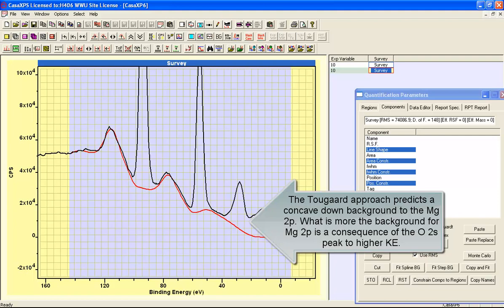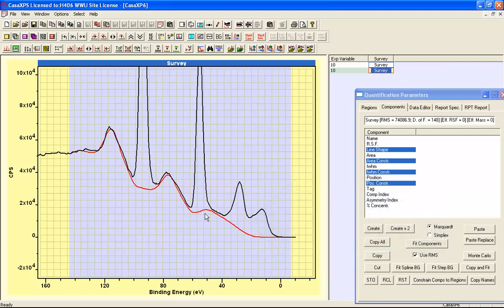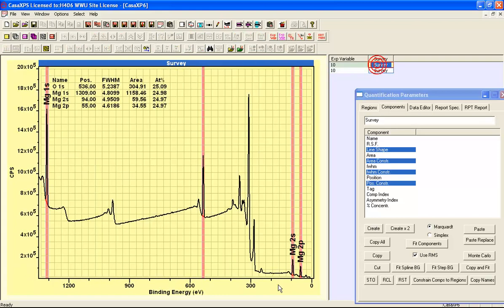And similarly, you can see that the magnesium 2s peak has a concave up background associated with it. So this is an approximation that is trying to illustrate how inelastic scattering would distribute photoemission as a result of electrons moving through the material before emerging into the vacuum.